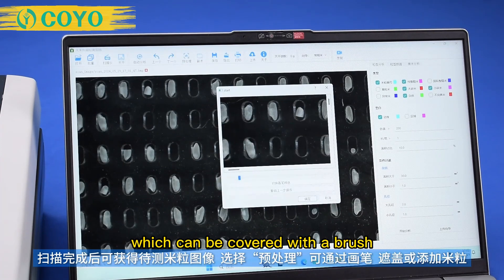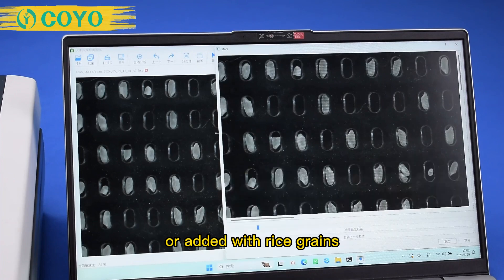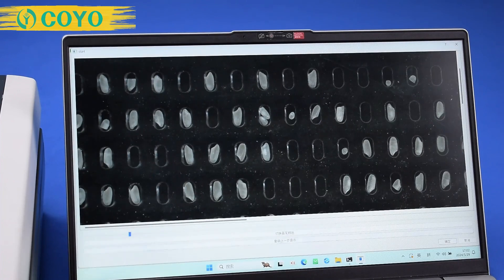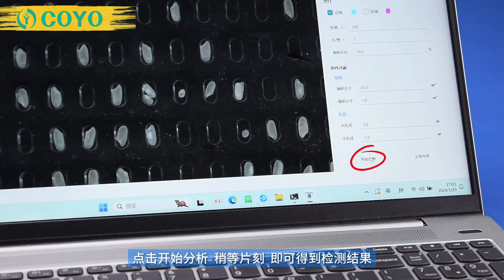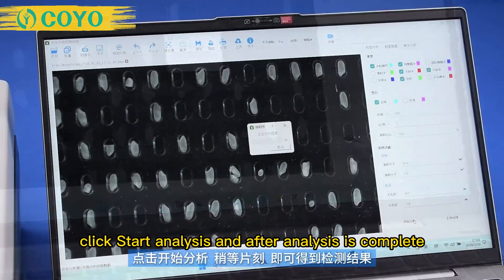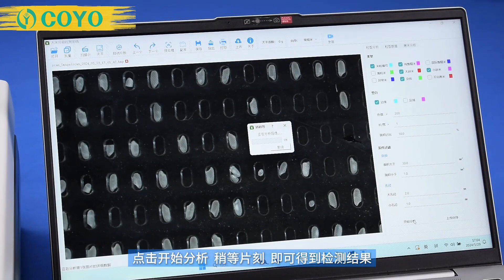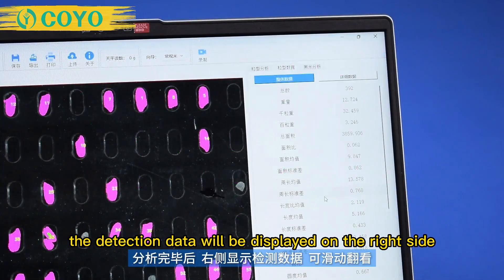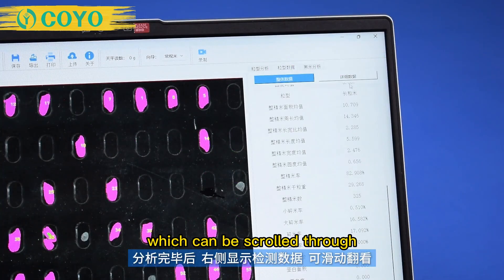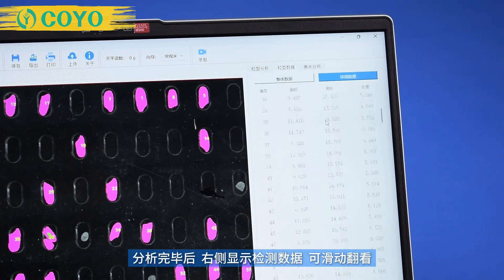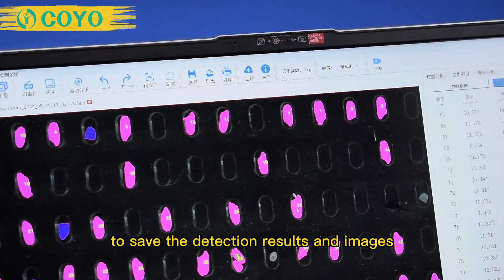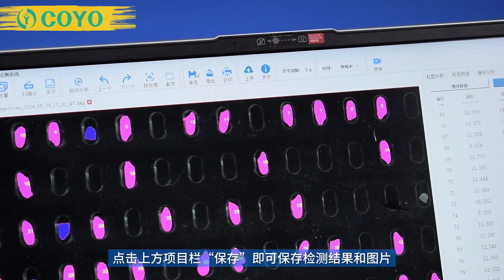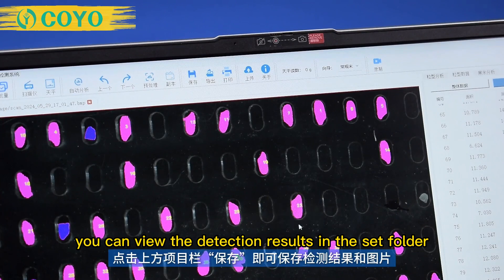Select pre-processing, which can be used to cover areas with a brush or add rice grains. Click start analysis and F2 analysis is complete, showing detection results and images. After saving, you can view the detection results in the set folder.